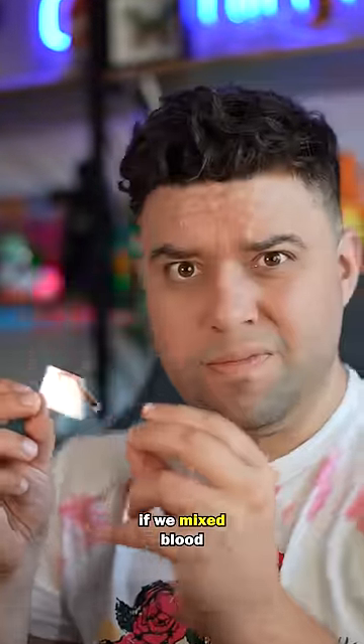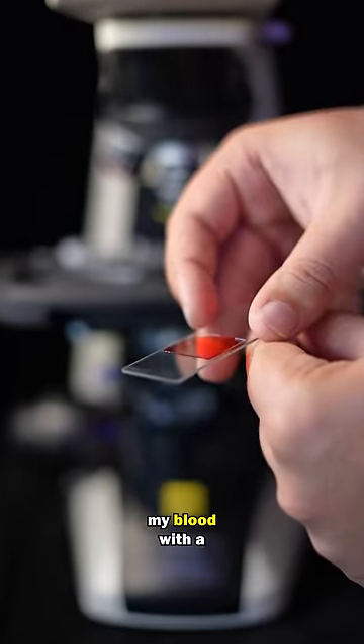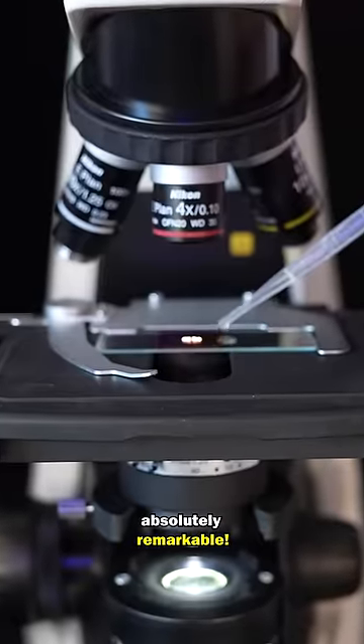I wonder what would happen if we mixed blood with a parasitic worm. Well, I mixed a drop of my blood with a parasitic worm. And what you are about to see is absolutely remarkable.